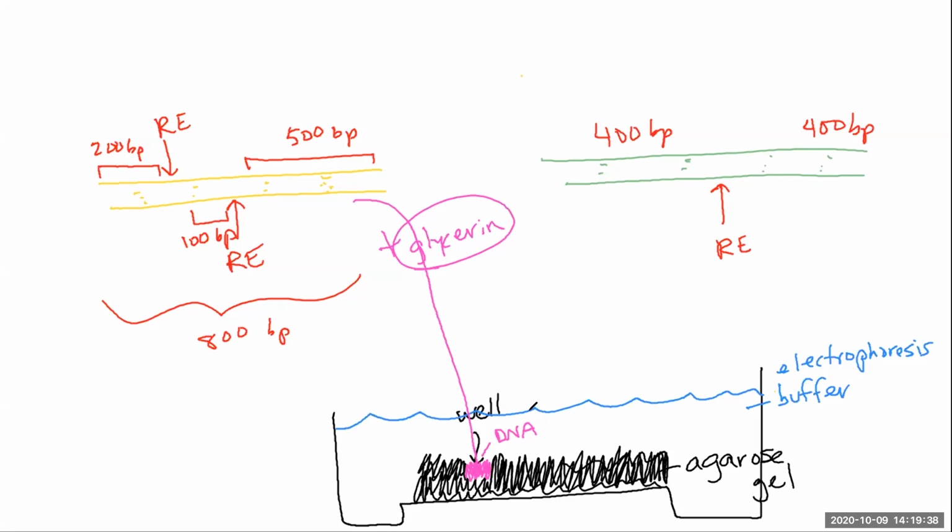We're going to hook up this electrophoresis chamber to an electrode system. You guys know, if you've ever jumped your car battery, think about the battery you're using. Let me change the color, make this black. There's a negative end of your car battery, and there's a positive end. It's really important which terminal is where.